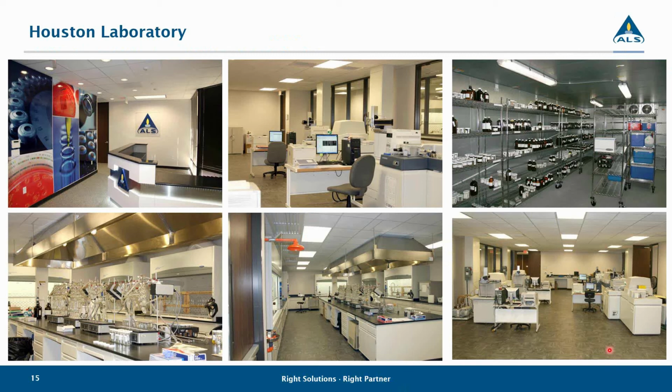Catherine had a follow-up question. Could you please elaborate on why data is considered very accurate when the labeled standard fails? NFG guidance requires flagging when labeled standards fail, and we end up with a lot of J-flagged data.